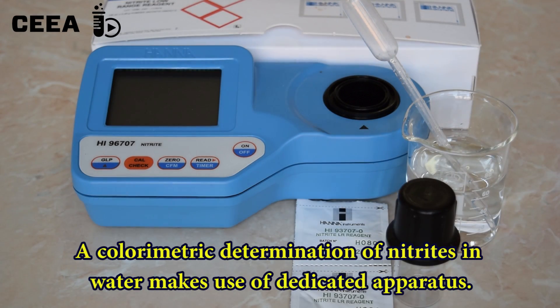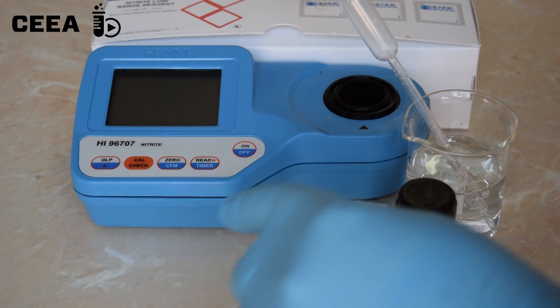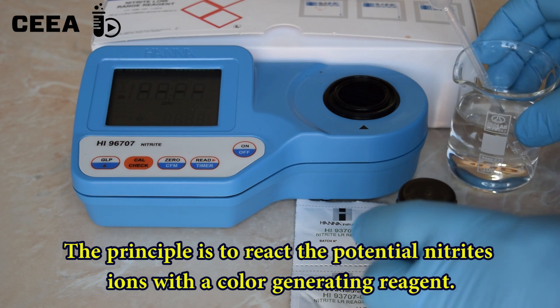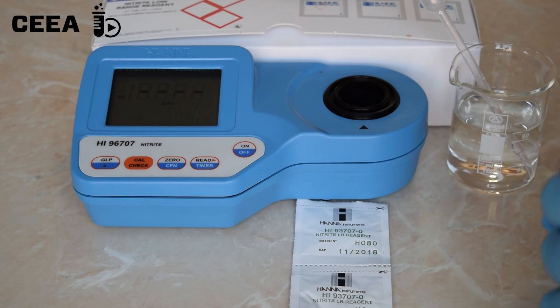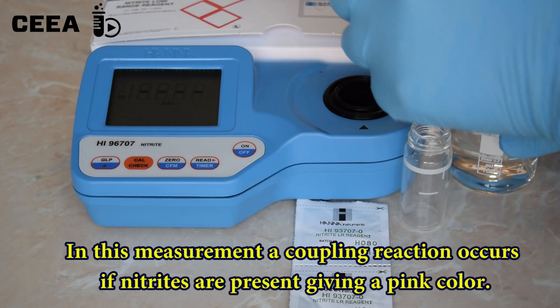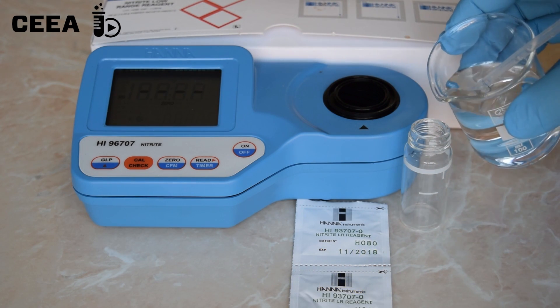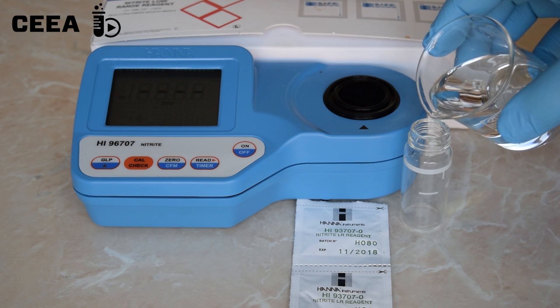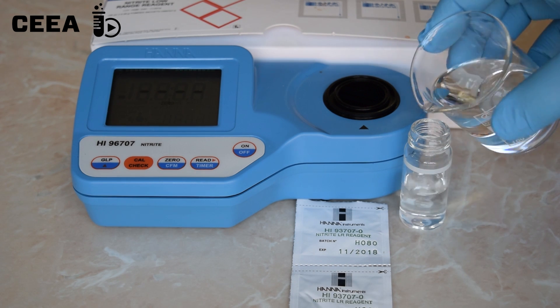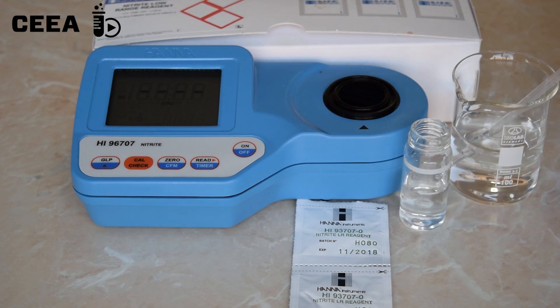The concentration of nitrites can be measured using specially calibrated devices. To measure the nitrites, the water sample is reacted with a color-giving reagent. A diazotization reaction can give a pink color when nitrites are present. The absorbance of this pink color is transformed into an electrical impulse, which is translated by the measuring device into concentration.